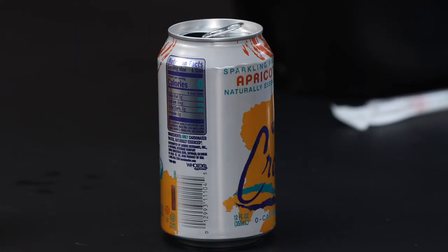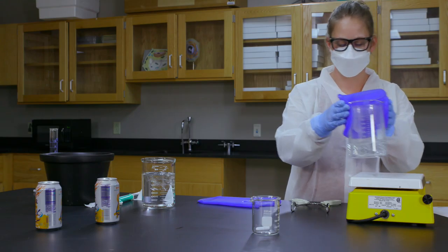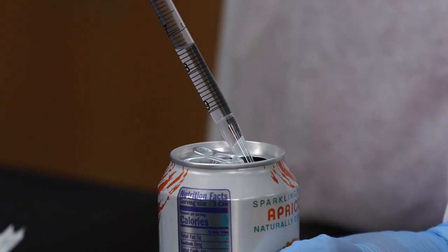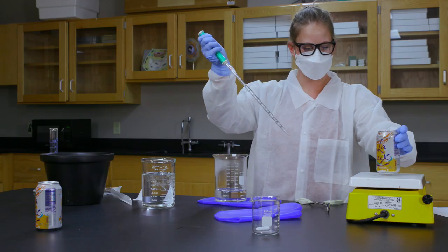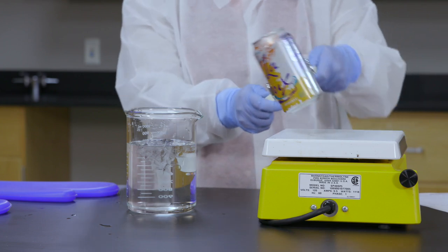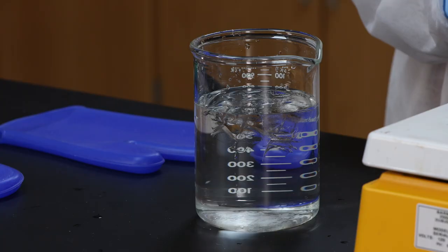Let's try the experiment again, this time with an empty aluminum soda can. Transfer 10 to 20 milliliters of boiling water to the can and place it on the hot plate until you see steam rising from the opening. We can't cap an open soda can, so instead, in one fast motion, turn the can over and submerge it into the ice bath.